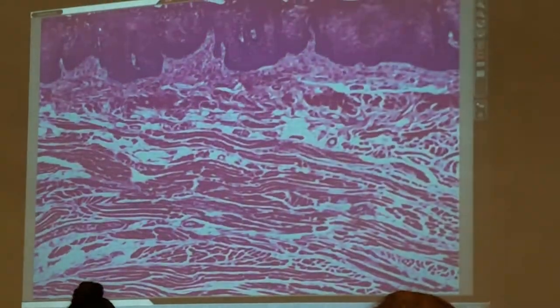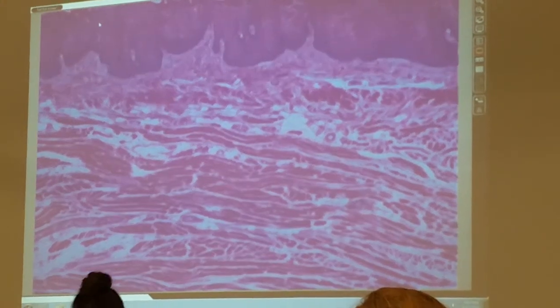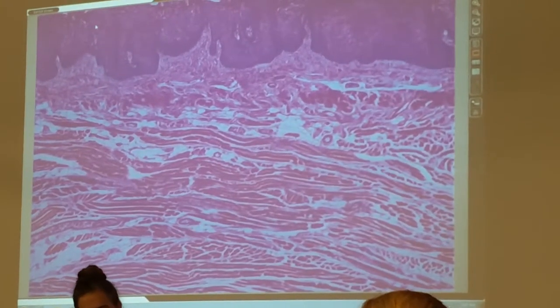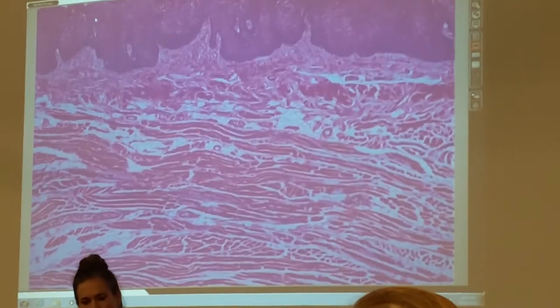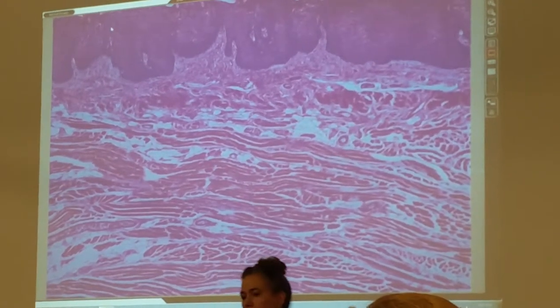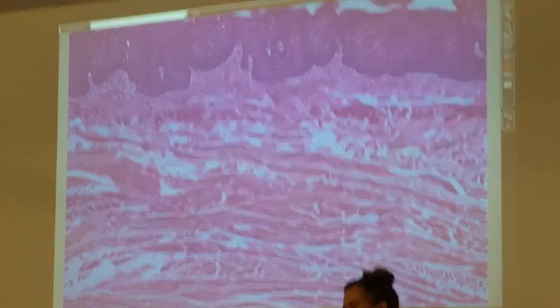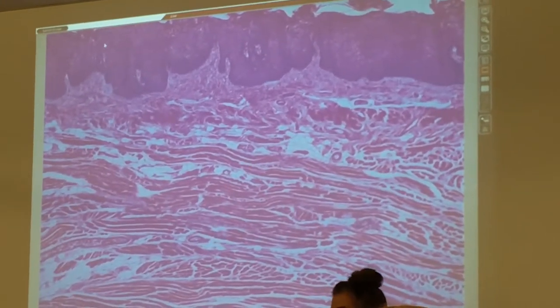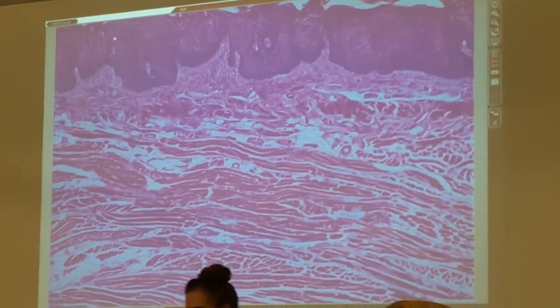Even on the low power, you can still see and be able to tell the different tissues. Again, more detailed structures — I would try to ask on the clearest magnification, which gave you the most of it, but you'd still be able to try to determine what the thing is you're looking at to give you perspective on what the organ is.